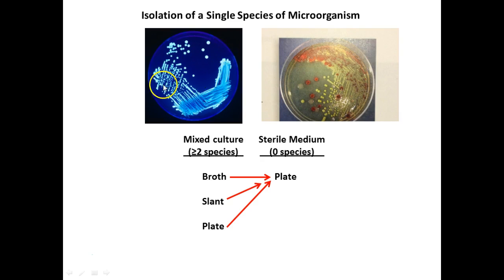On this one, not so much, but you can see this pattern, which unfortunately we weren't able to do on those plates. I wonder if I still have one of my stashed plates. Yeah. So this one's kind of dried out, but yet still liquidy. And so you can see, right, you're going to put the organism and you're going to pick up a lot of organisms. So you'll end up with a lot of growth. And then as you spread it out in this technique, you're going to eventually get to where you've got single organisms, hopefully growing into a colony. Hopefully it's pure.